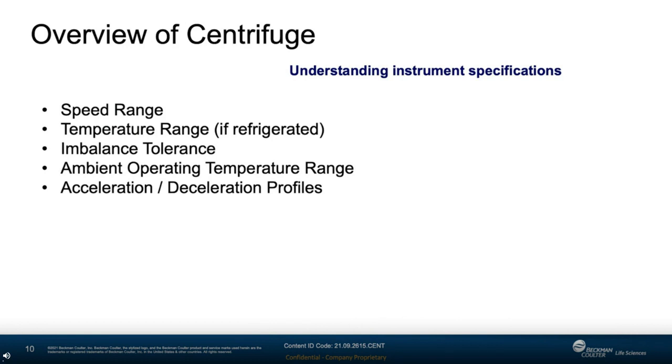Ambient temperature will affect the centrifuge's ability to cool well. Deceleration profiles are related to the degree of unwanted mixing which can occur when the brake is applied. And centrifugation produces aerosol. So depending on the hazards that are specific to your samples, you may have to take more than the regular precautions.